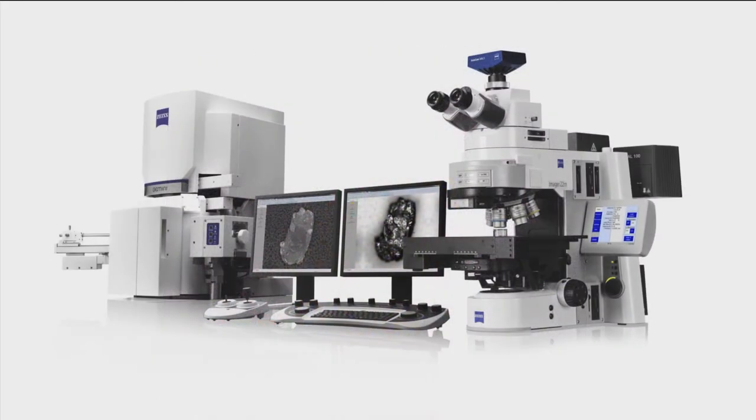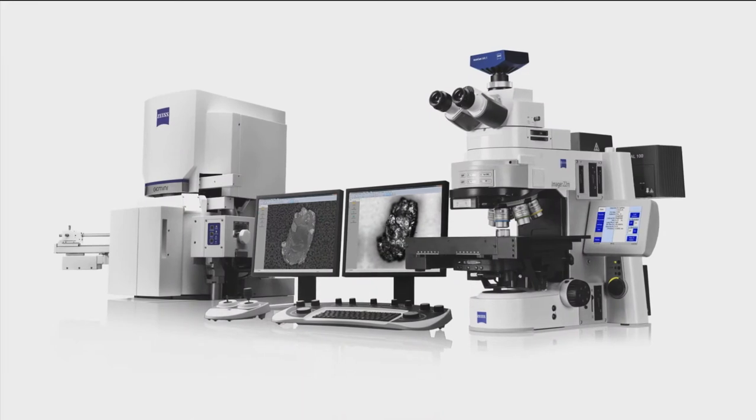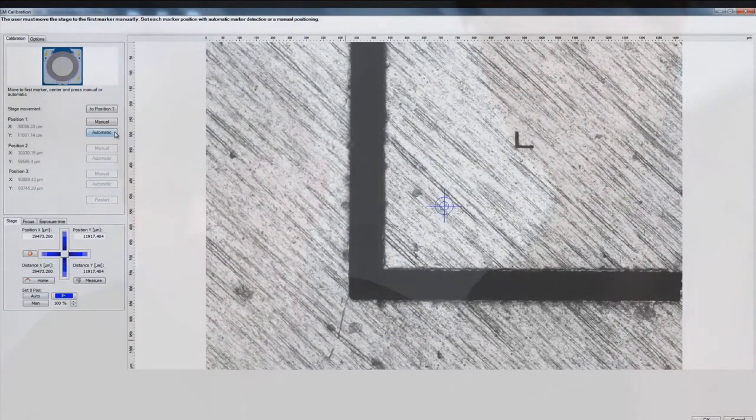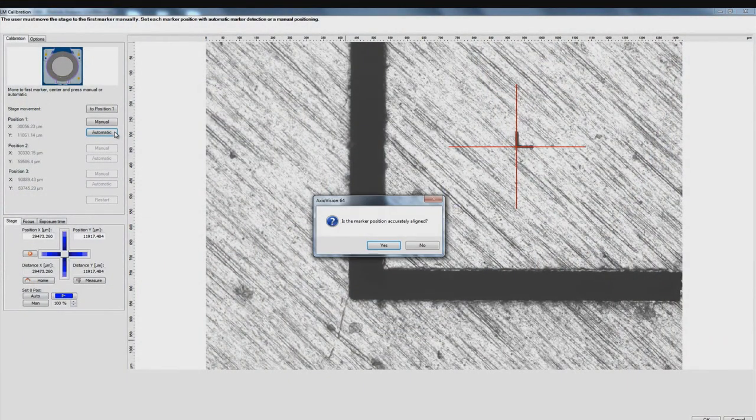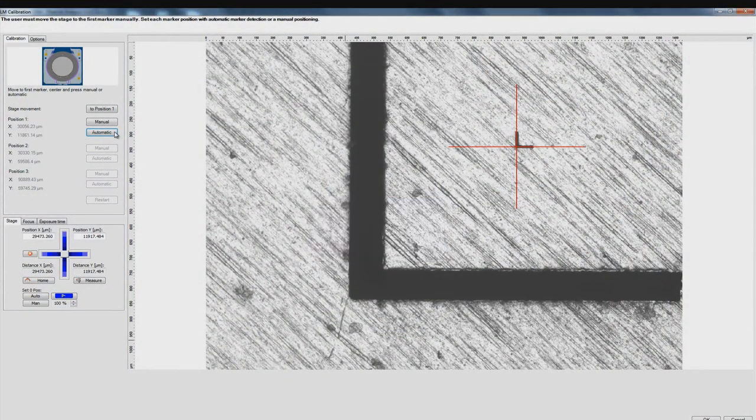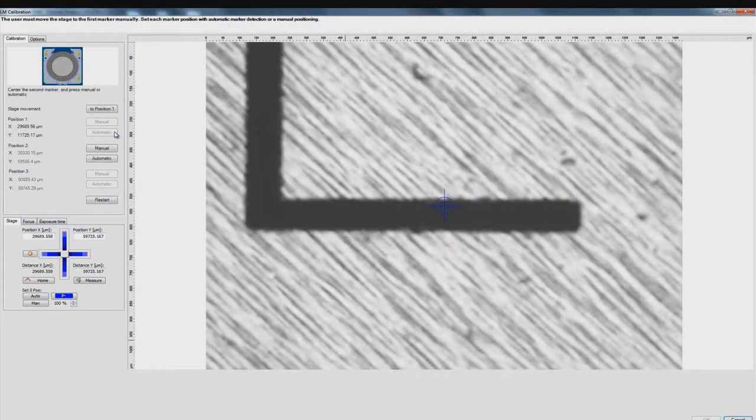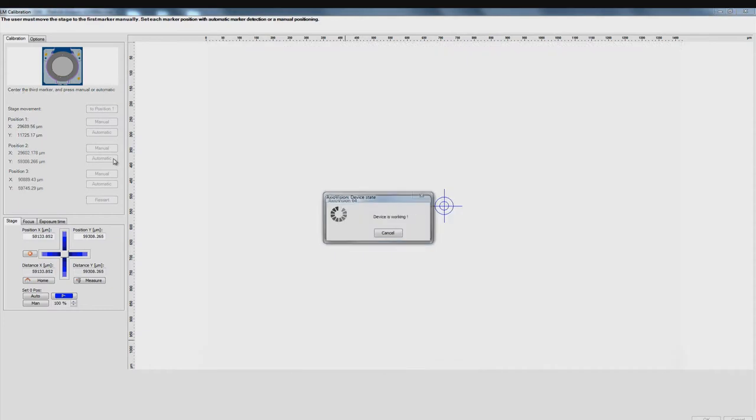If so, you can do all of these things quickly and easily using Carl Zeiss correlative particle analysis. First, define your reference coordinate system on the optical microscope.